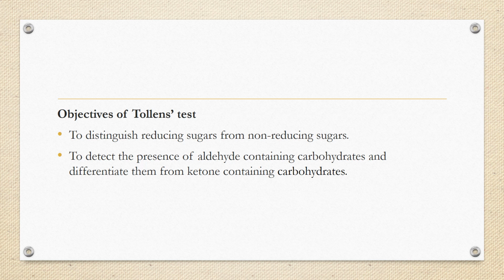So we will test if the given sample contains aldose or ketose, because Tollen's reagent reacts with the aldoses.